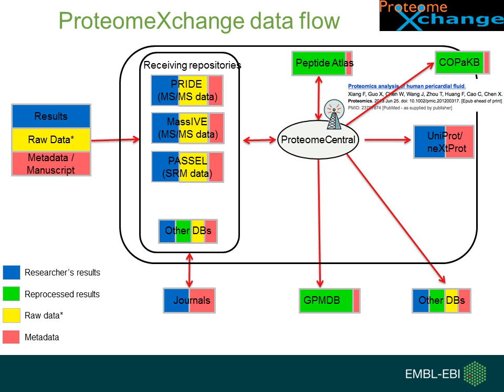You might be interested only in a relatively high abstraction level along the same lines like UniProt and NextProt. They provide these proteins, let's say these specific isoforms have been confirmed by mass spectrometry. These modifications have been seen, as opposed to focusing on the underlying mass spec evidence.